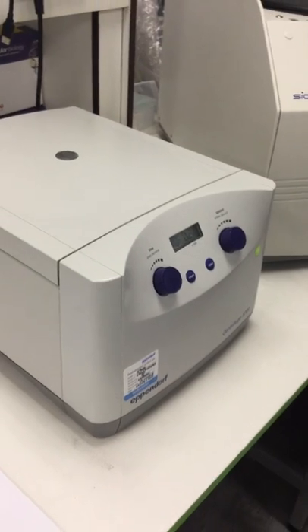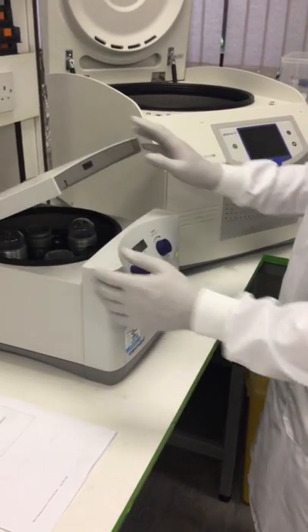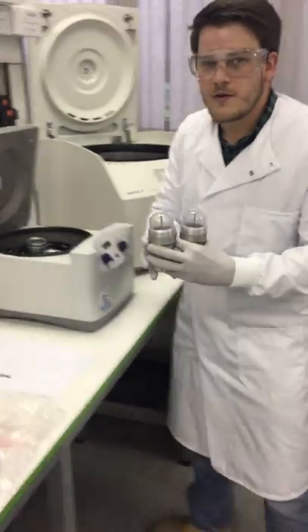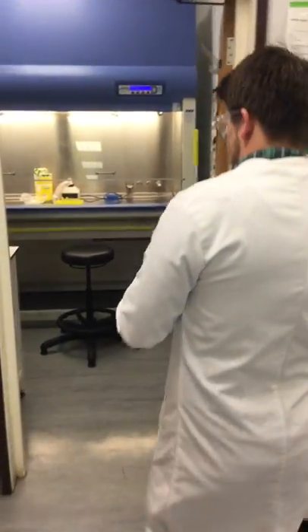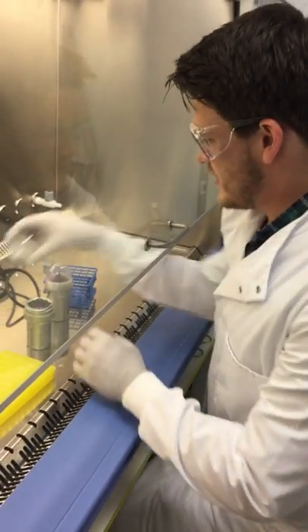Now these tubes have spun for 10 minutes at 1600 RCF. And now we take them to our processing area. On this occasion, our processing area is a biological safety cabinet. Hopefully we get some nice separation here.